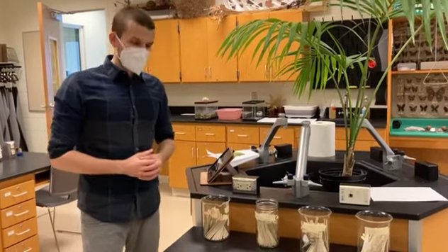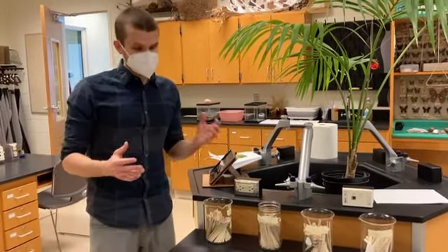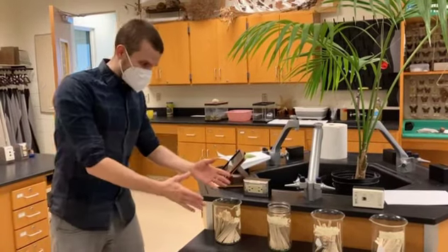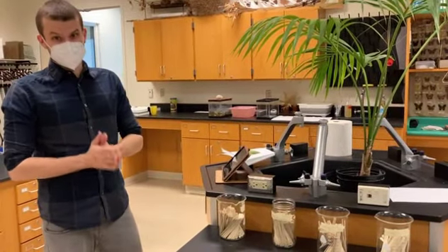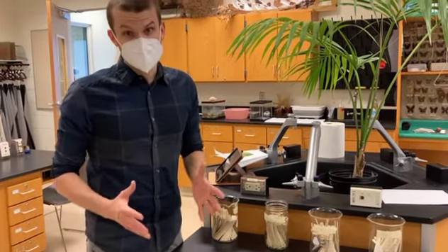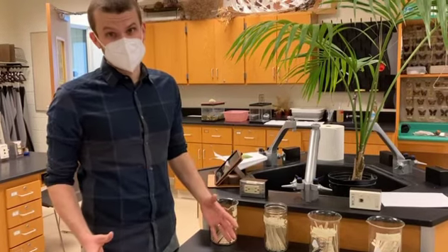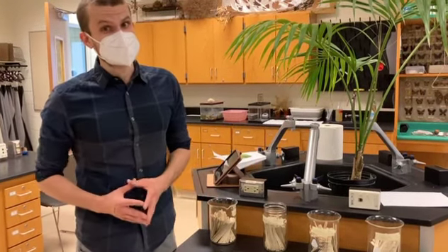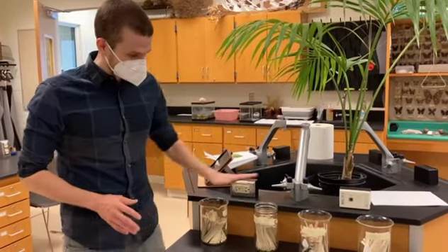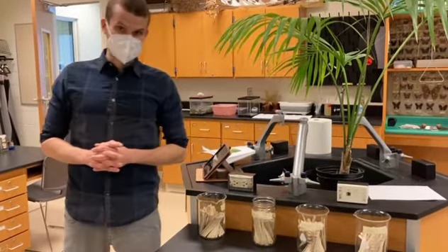All right, so now that we have a good idea of what fruit flies are as not cute but useful organisms, we have our 4 stations for our fruit fly crosses. Now we're using these stations rather than trying to breed fruit flies over the course of several weeks. You could do that perhaps in other biology classes, but in interest of time, we're going to stick to these 4 popsicle stick stations.